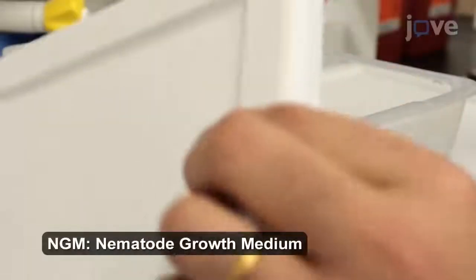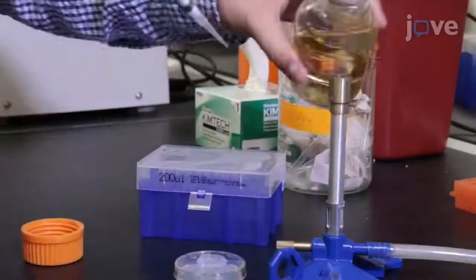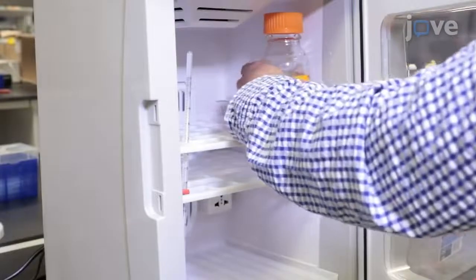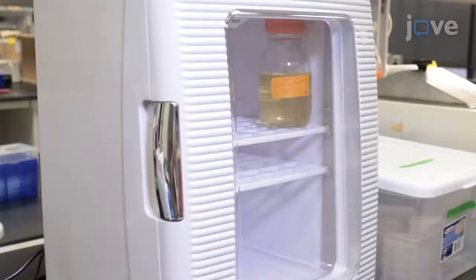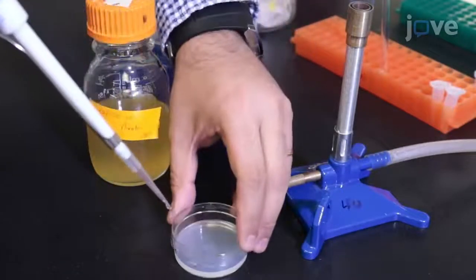After preparing the NGM plates, let the plates dry at room temperature for 2 days with the lid closed. Then inoculate the OP50 bacteria in the sterile Luria broth. After inoculating, leave the inoculum in the incubator till the OD is between 0.2 and 0.4. Then place a drop of the OP50 inoculum in the center of the dry NGM plate.